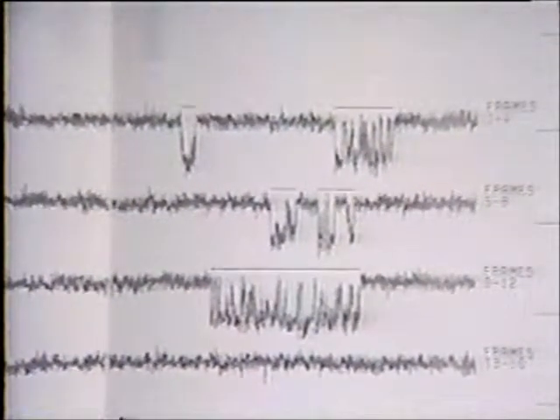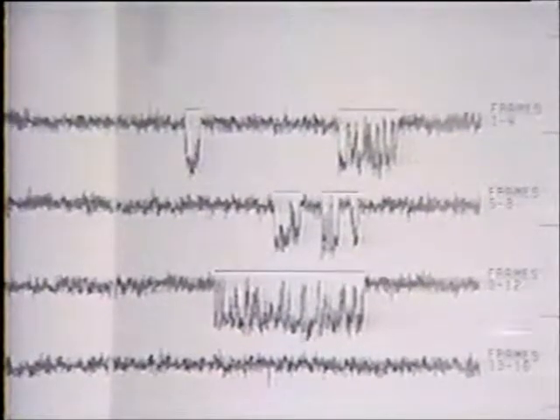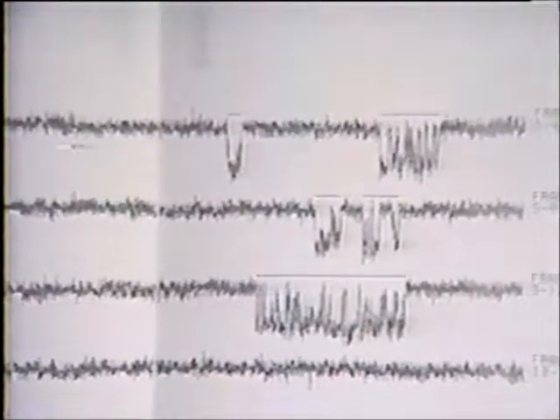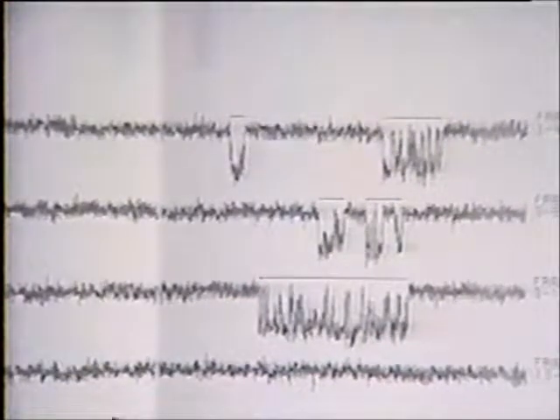The data appears as bursts of activity. The computer has underlined those bursts which it has identified. This particular program is rather robust and isn't easily fooled by noise and seal breakdown and that sort of thing. What information is in this record?